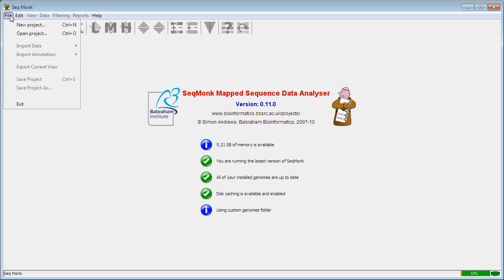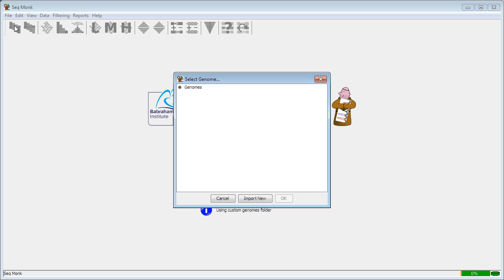We do this by selecting File, New Project. When we first do this, we see a list of the genomes we currently have installed on the system. This is a new installation, so we don't have any at the moment, so I'm going to fetch one from our servers. To do this, press Import New.